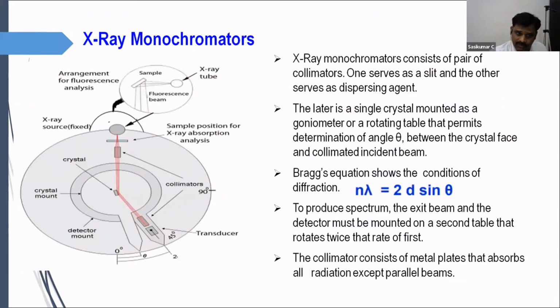this will filter out K beta lines so that you can use a monochromatic source. So as we said, the WDXRF will give you clarity about the resolution, or it can resolve your peaks very clearly, resolve your results very clearly. As you see in this image, we have the X-ray source, and the X-ray source is made to fall on your specimen, and your specimen is giving rise to X-rays. So once you irradiate your specimen with X-ray, the X-ray will be emitted from your specimen.